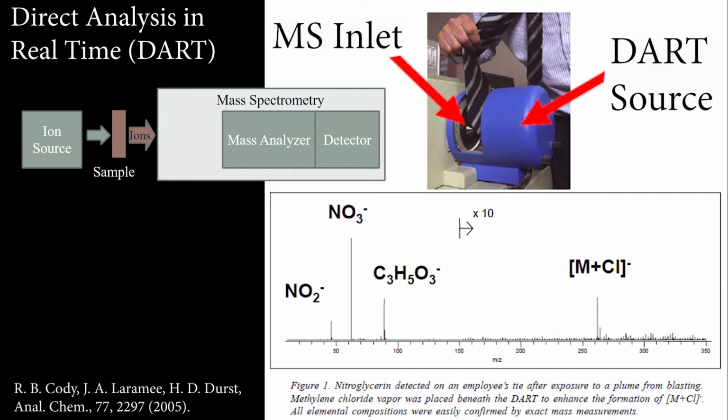Mass spectrometry and all those other things take all that sample prep. Wouldn't it be wonderful to just skip that and just shove stuff into a little gap and immediately get mass spectra? That's really the promise of ambient ionization. What we're going to do in ambient ionization, as you can see in that schematic, is the ion source is going to be outside the instrument, obviously at ambient pressure, hence ambient ionization. You're going to put the sample in a gap between the ion source and the instrument, and you're going to desorb gases from the sample, and they should leave the sample as gas phase ions and then go into the mass spectrometer where they can be analyzed.